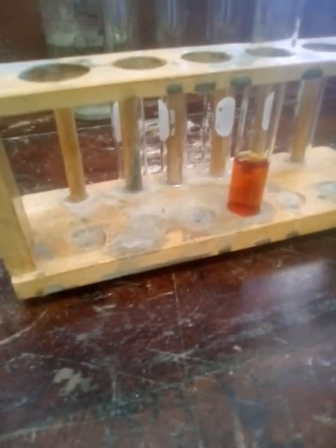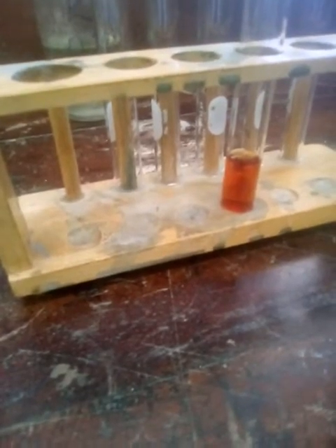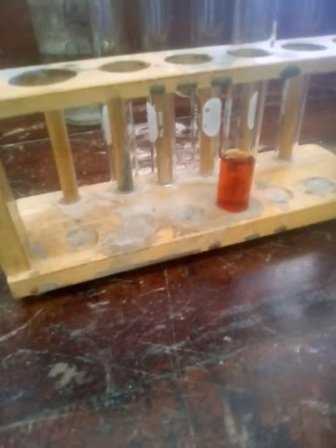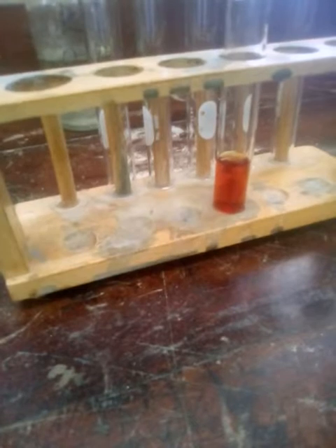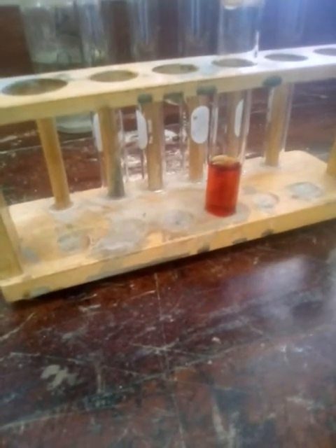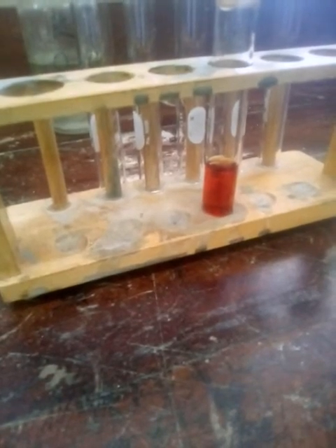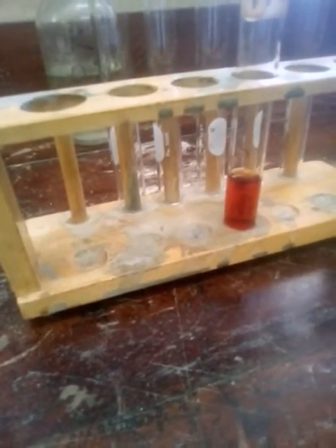We're seeing a color change when the reaction took place between acidified potassium iodide and hydrogen peroxide. Now, as I said before, this reaction is not as vigorous as some of the reactions that you might have seen on the internet or in other places, because we are using diluted reagents, not concentrated reagents.